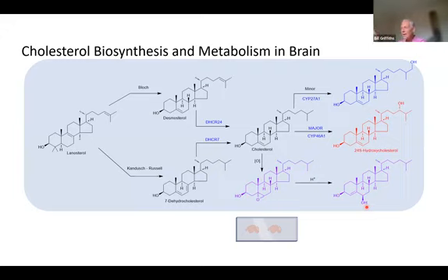So we've got a rather complicated pattern here in that we've got 27 hydroxycholesterol, 24 hydroxycholesterol, which is the major metabolite, and we've got these two others, which are auto-oxidation artifacts, and in fact, they're all isomers. So this is where the LC comes in. We're able to separate out all these different isomers. So we can measure the 24S hydroxycholesterol accurately without contamination of the auto-oxidation artifacts or 27 hydroxycholesterol.